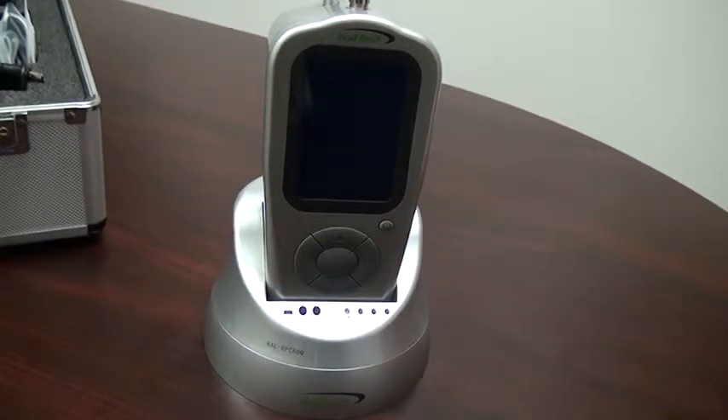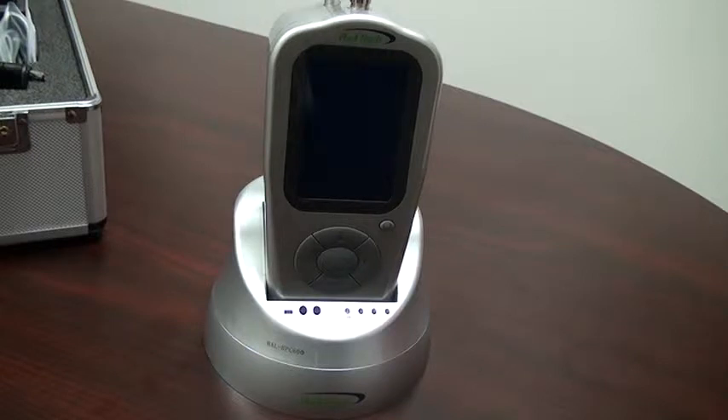All HAL Technology products are CE certified. If you are interested in obtaining this handheld particle counter, please contact us so that we may provide a detailed quote including optional accessories.